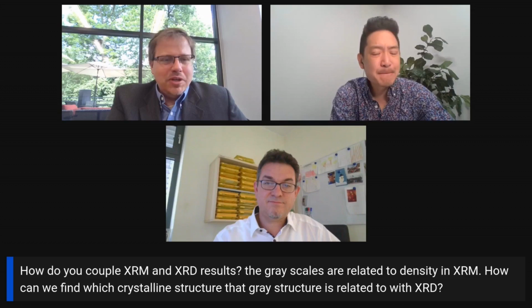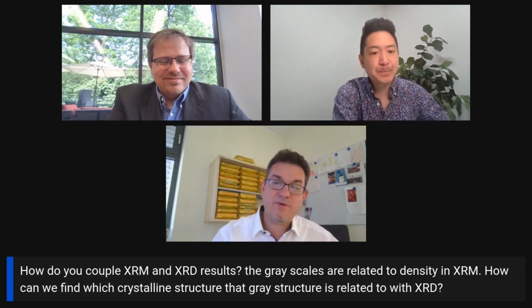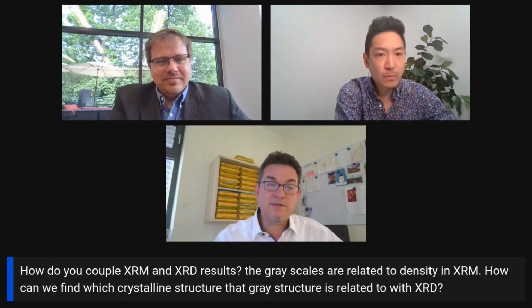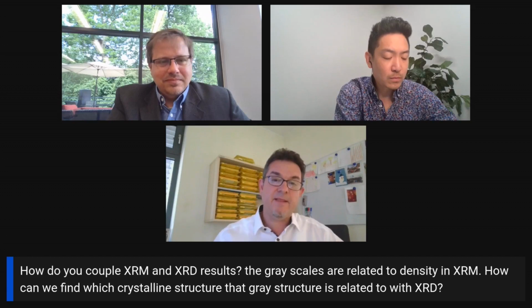Yeah. Marcus, any thoughts? Yes, of course. It's important to understand that XRM is just looking at density differences, so basically absorption differences. So there's no real sensitivity to the molecule unless you use some more modern technique like phase contrast, which I have skipped for today.